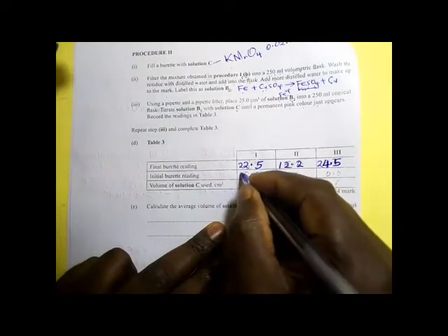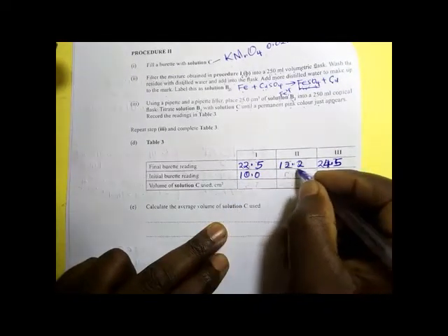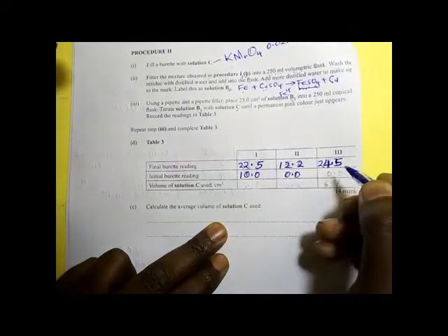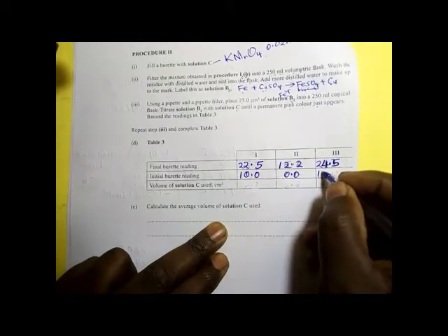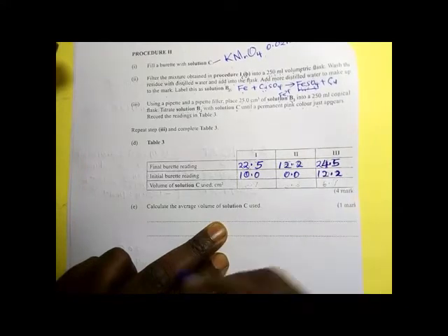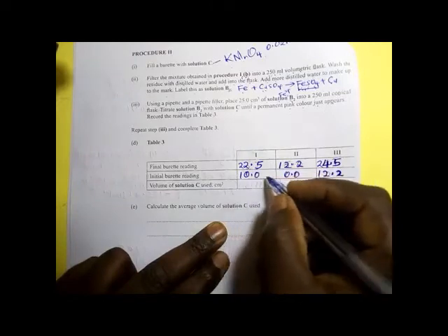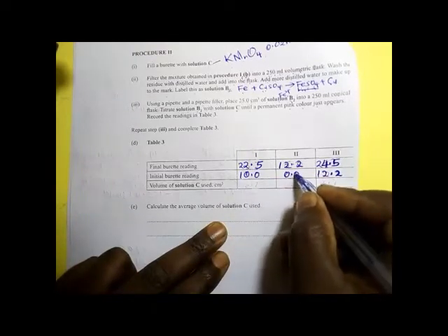Here the initial, we can even start at 10. It was started at 10. Initial here is 0.0. Initial here is 12.2. So I want to show you that it is not a must that our initial is always 0. Initial can be any volume. It is up to you to decide. So it is not a must that it should start at 0.